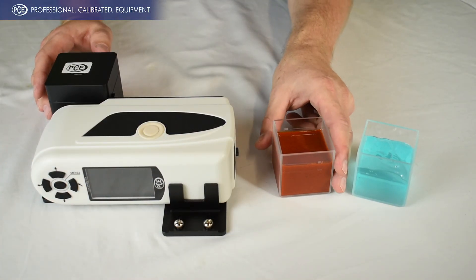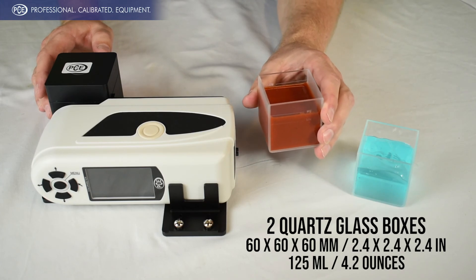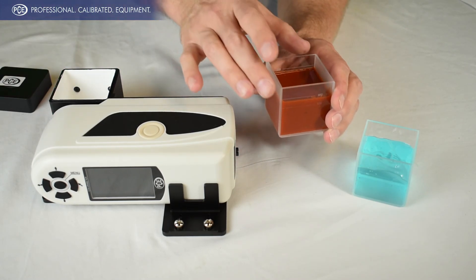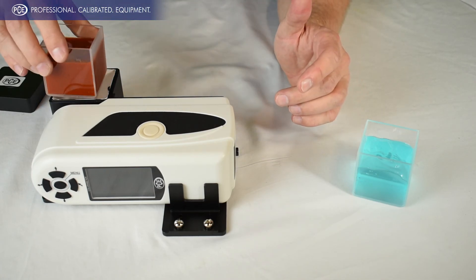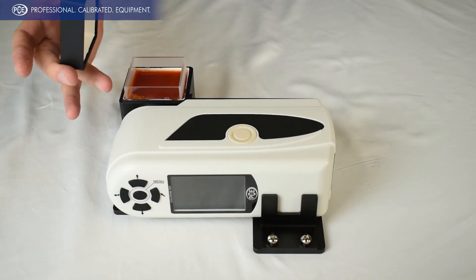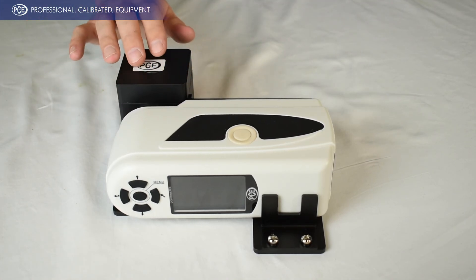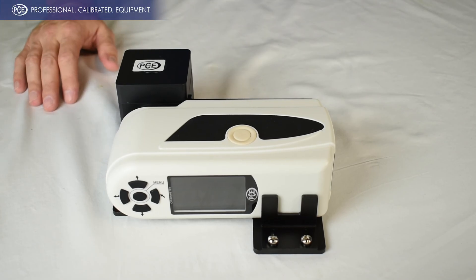Now we have the glass testing box here — it comes with two of these. So you just take your sample and insert it right into this box. You just put the testing box inside there and put the lid on. That will keep out your ambient light and then you're ready to make the test.